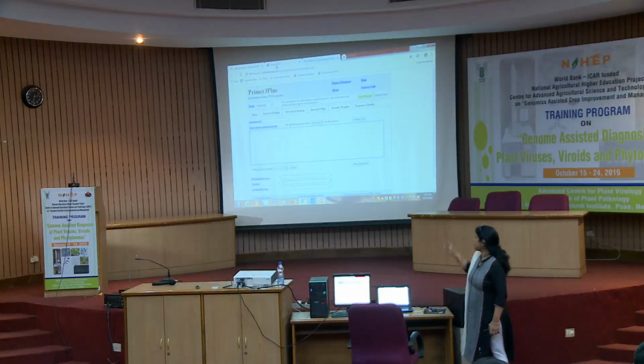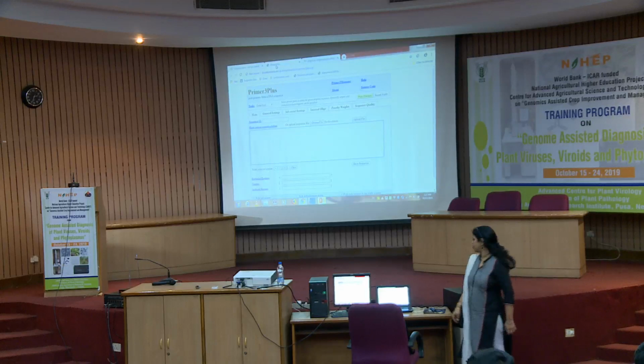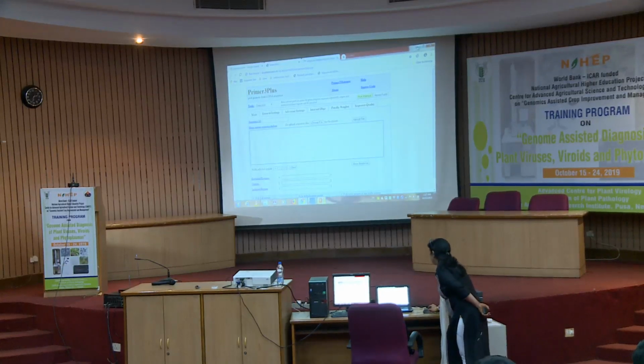Okay, so this is the window, right? Let's suppose I pick any of the sequence.